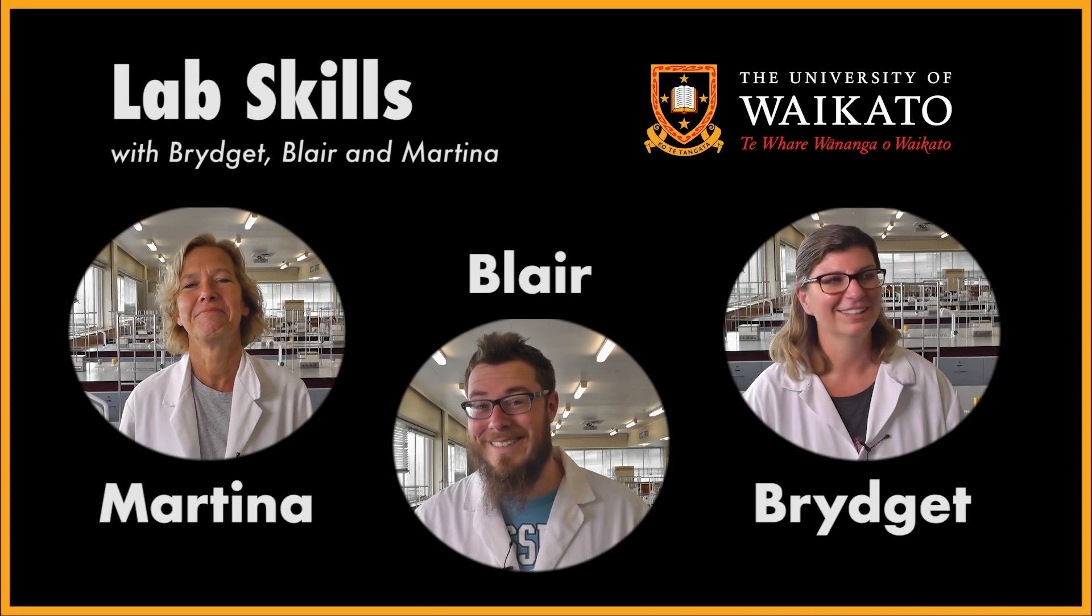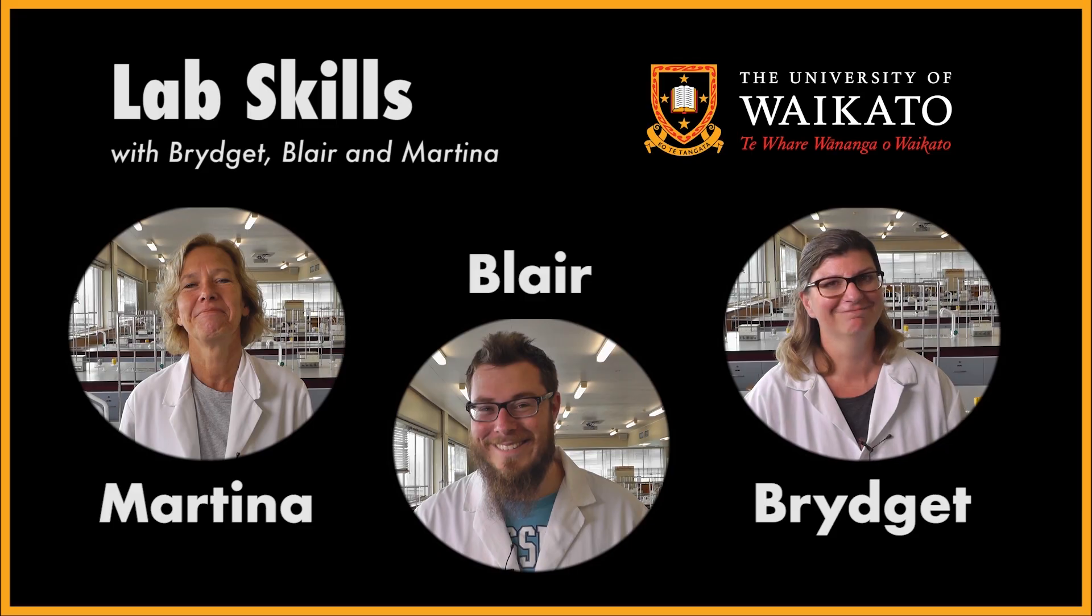Martina, Blair, Bridget. In this video we are going to show you how to carry out a liquid-liquid extraction.